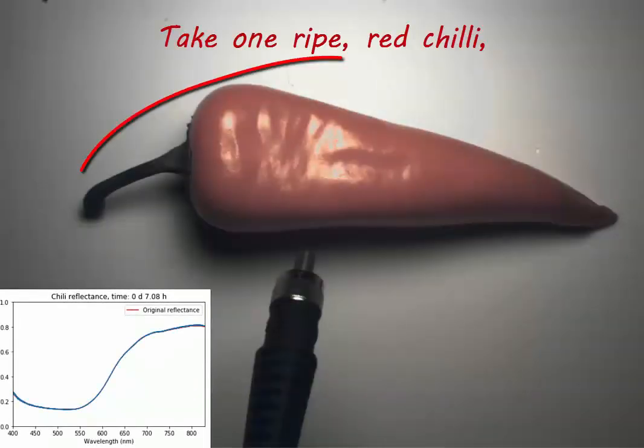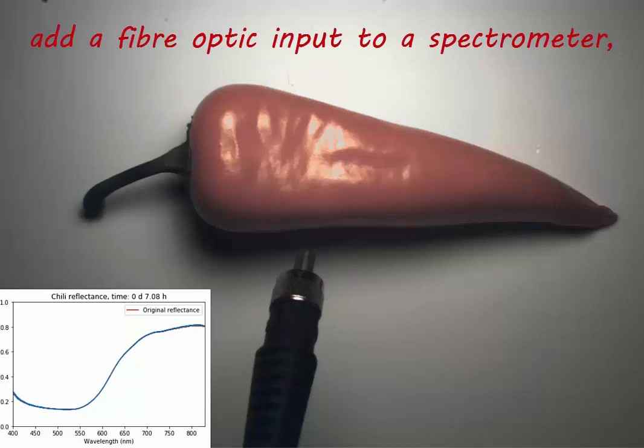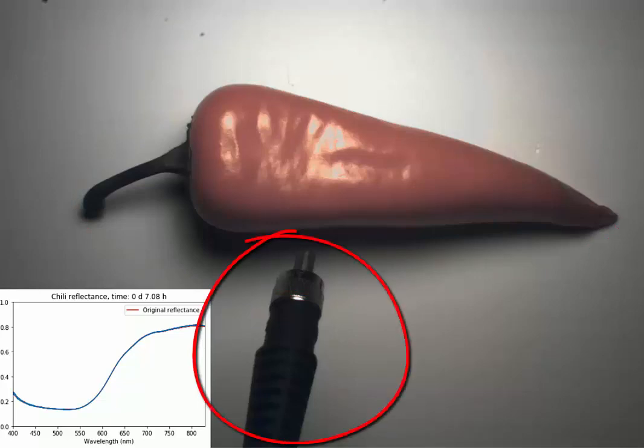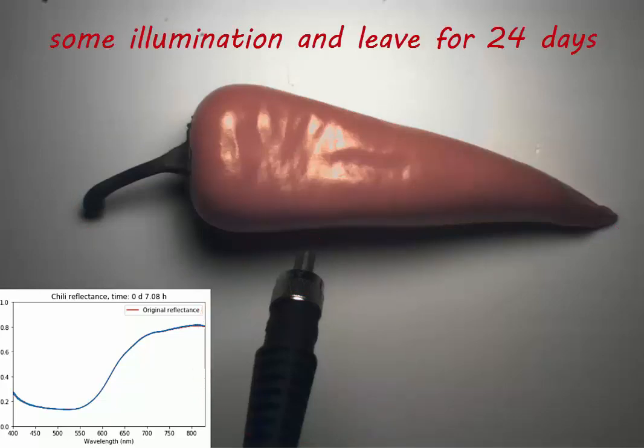First, take one ripe red chilli and a fibre-optic input to a spectrometer. Add some illumination and leave for 24 days.